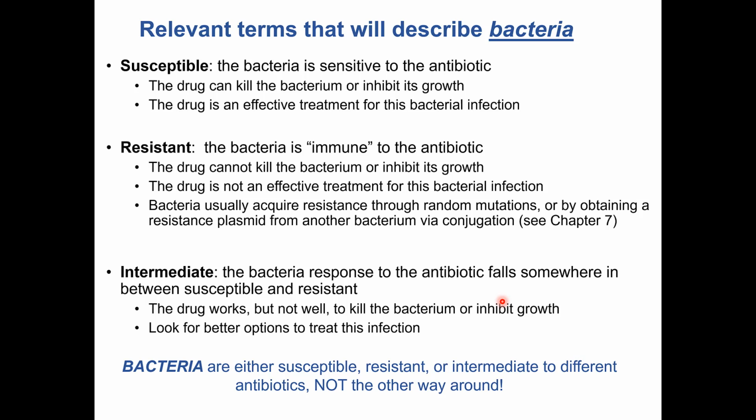And then sometimes a bacterial response to a drug will be somewhere in between susceptible and resistant, and we use the term intermediate to describe that. So in other words, the drug kind of works against that bacteria, but not very well. And in the hospital setting, you might want to look for better options to treat this infection.